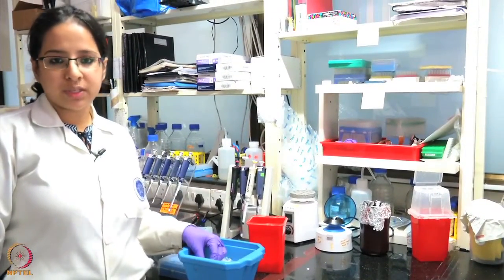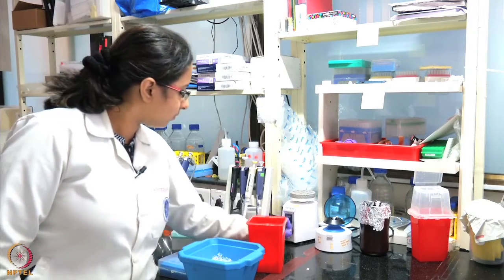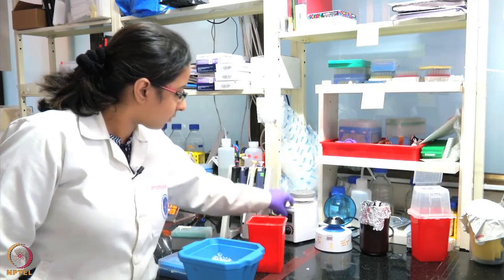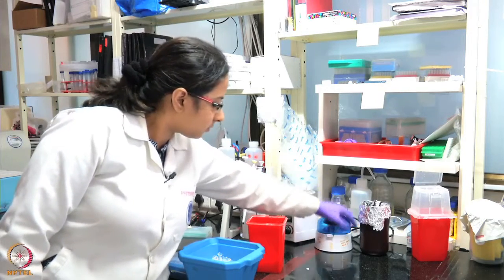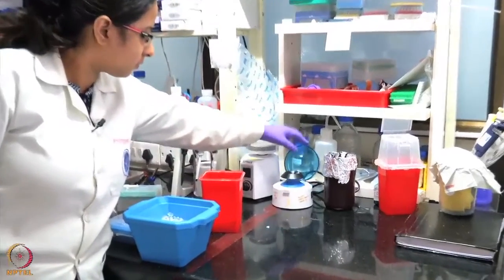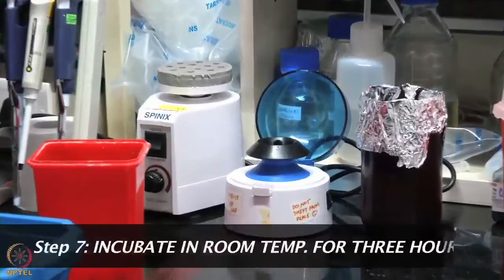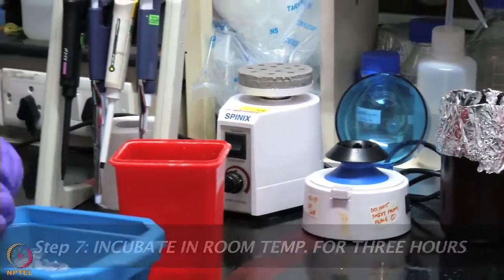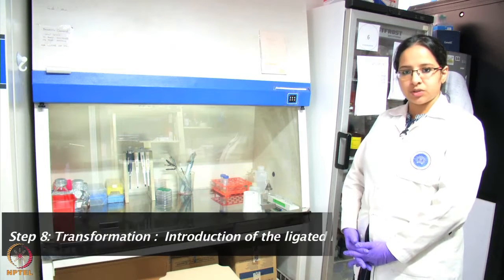Now our ligation mix is ready. We will vortex it a little, followed by a short spin. Now we will incubate this at room temperature for 3 hours. After ligation is done, the next step is transformation.